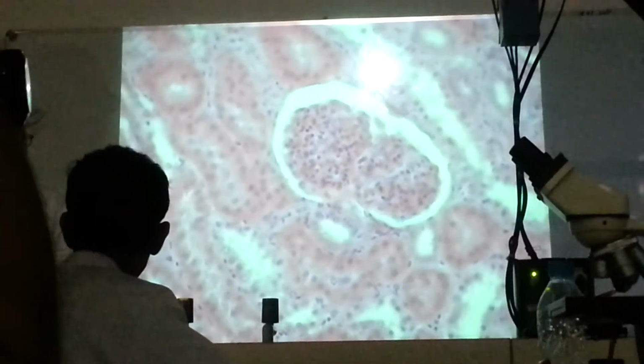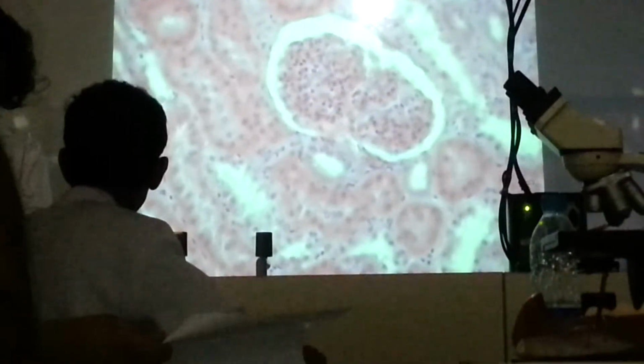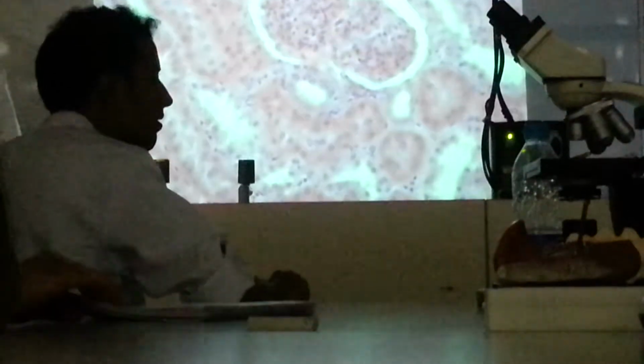Okay? So simple means one layer of cells. Squamous cells are flat and their nuclei are flat. This is the first slide.